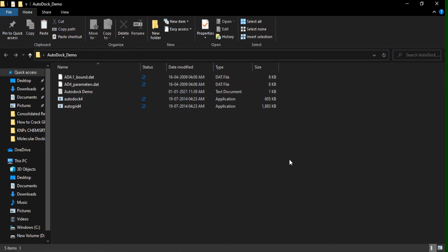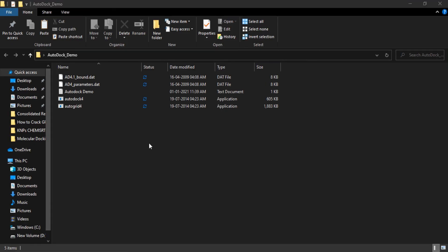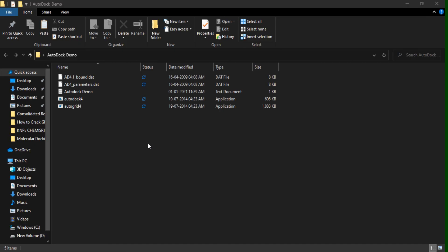And now your system is ready for running AutoDock. In our next tutorial, let us see how to prepare our protein like cleaning and all. So thanks.